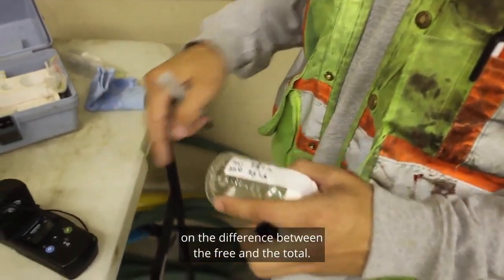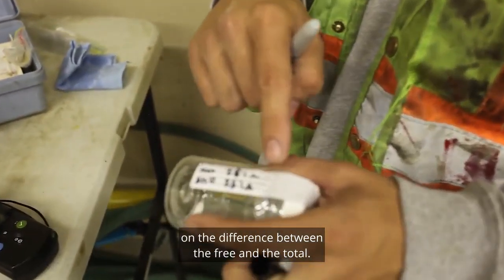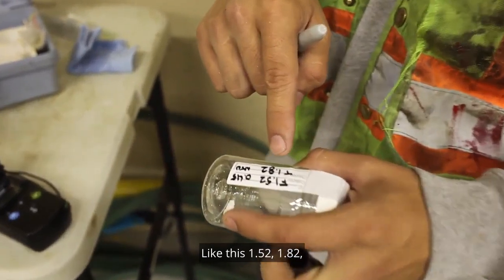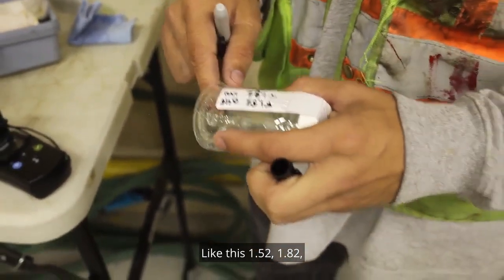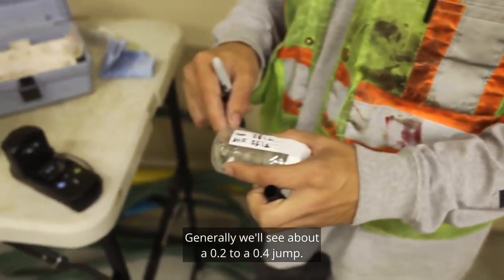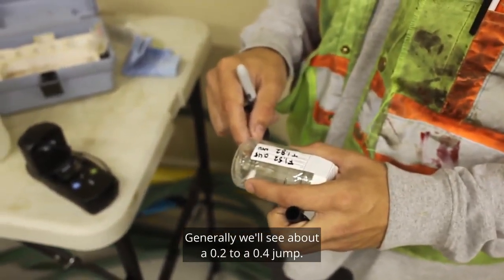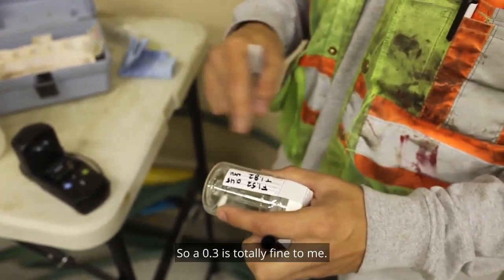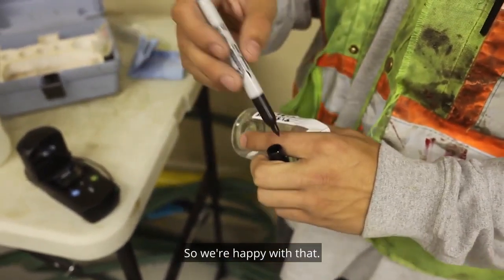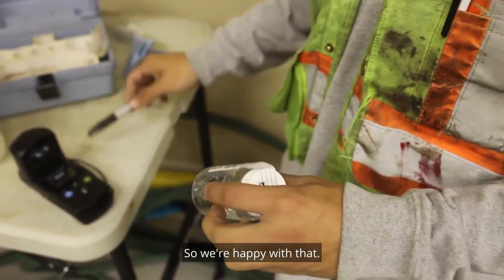We always keep an eye on the difference between the free and the total. 1.52, 1.82 — that's about a 0.3 difference. Generally we'll see about a 0.2 to a 0.4 jump, so 0.3 is totally fine. We're happy with that.